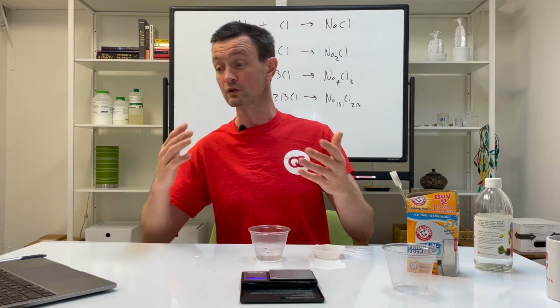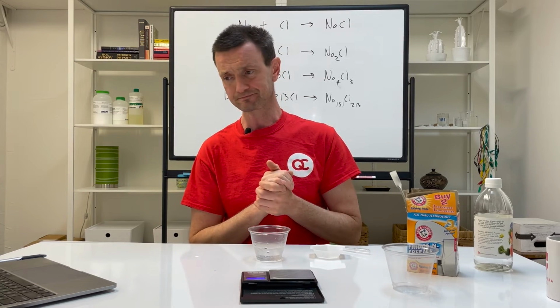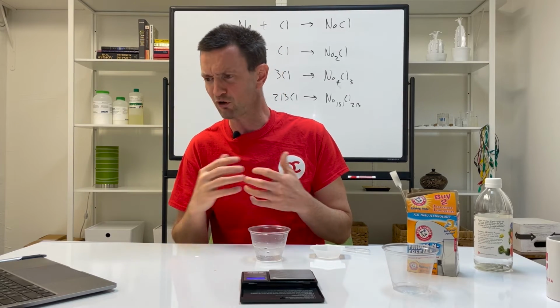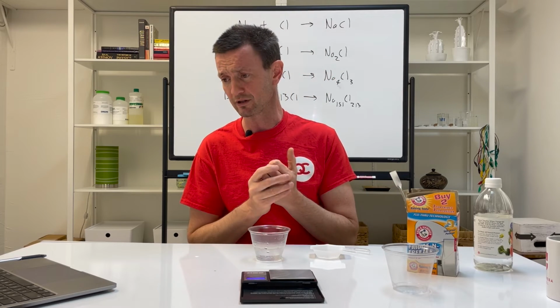You can record whatever you see in a data table that you can make in your notes. Don't forget, you should wait until the reaction is finished. This is 3B. And observe what the leftovers are. This is the key thing to observe, is what the leftovers are.